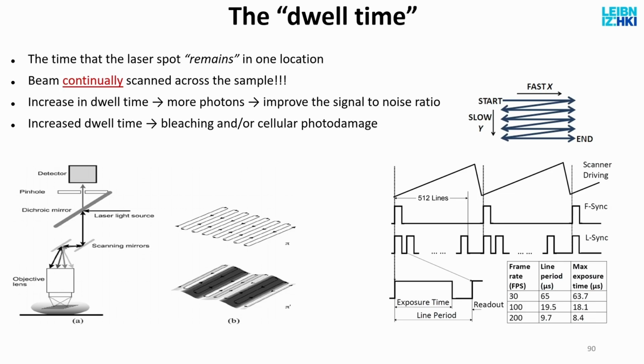The camera chip contains a certain number of CCD elements, the size of which is whatever, 6 microns, and then your pixel size is what it is. It's determined by the camera, and it's determined by the objective as well. In laser scanning confocal, it's entirely up to you.